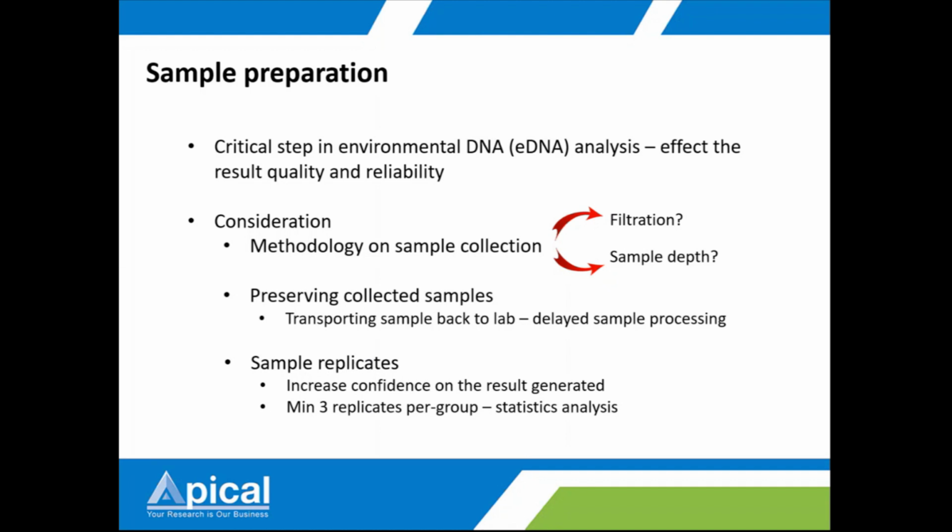Okay, and sample depth is also very important. You know that water has different depths of the water column.